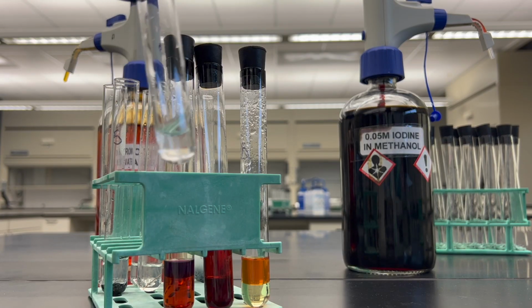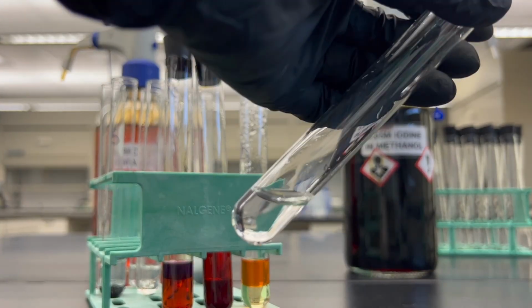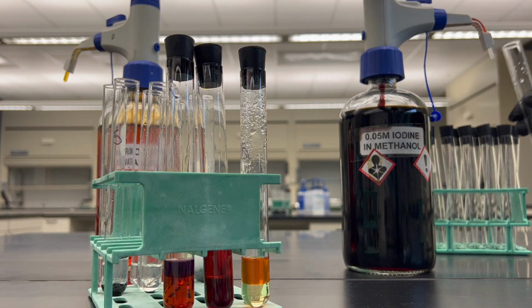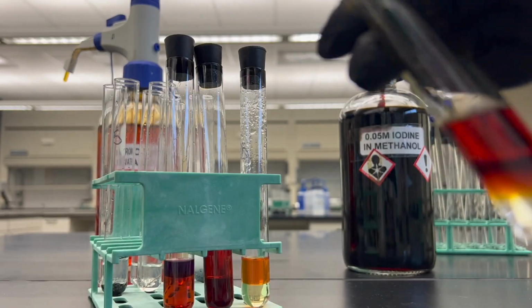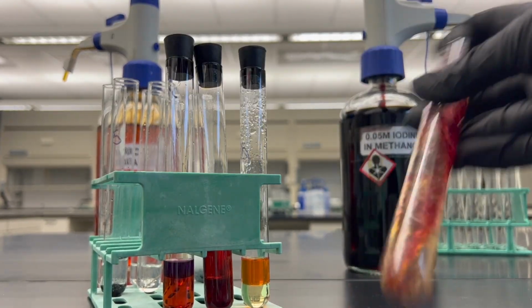Next, I have some sodium bromide, so bromine ion. I'm going to add my hexanes. And then I'm going to add a little bit of my iodine. We're going to cap it. Shake vigorously.